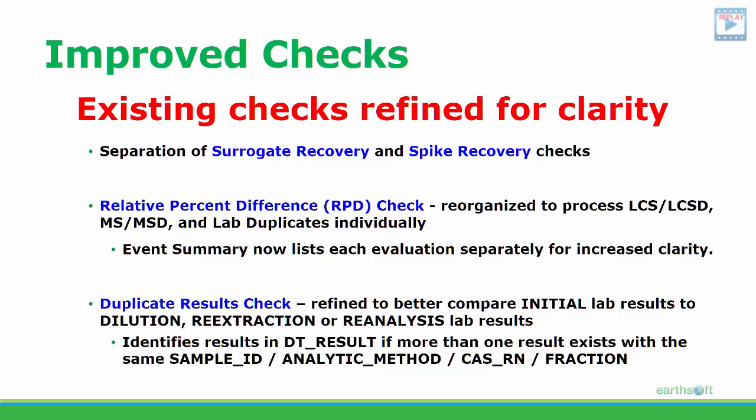And if I could insert, the difficulty is there currently is no way to select one of those batches, one group of results. You can definitely see both results, but if you have 68 analytes, well, then that's a lot of manual changing.